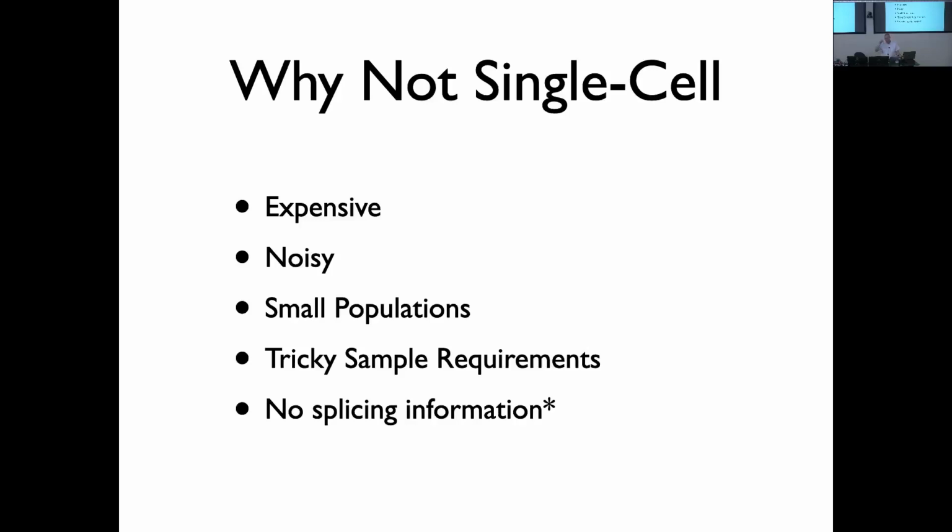They have protocols that get around that. So instead of doing single cell, you can do single nuclei, which has pluses and minuses, but it's tricky. If you're doing single cell, you have to be able to get those cells disaggregated. So if it's a tissue, you need a way to break up the tissue without lysing the cells, which is tricky, unless you want to do spatial single cell. So that's problematic.